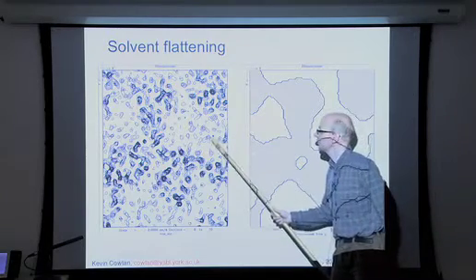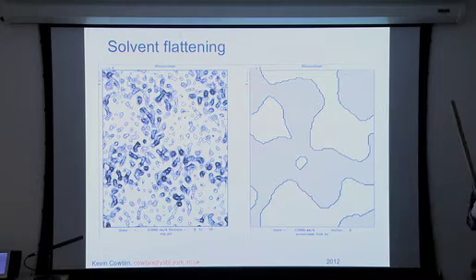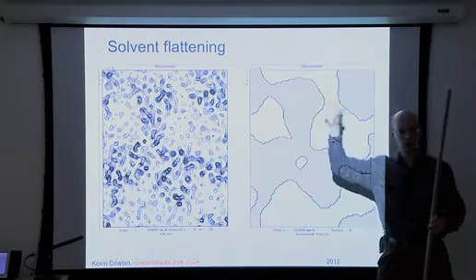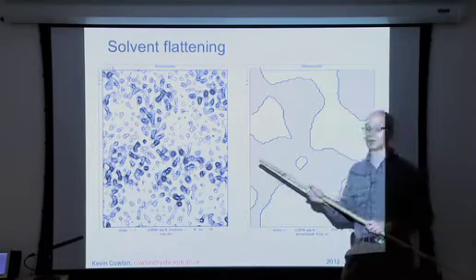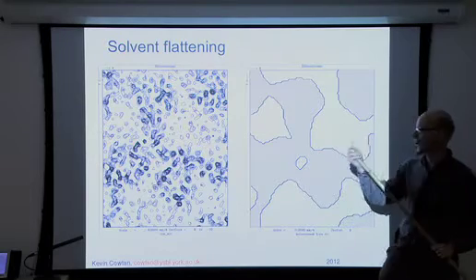So the question is, what are the features in the solvent? Well, if your phases are very good, then they correspond to ordered solvent, real features where the solvent isn't completely disordered. If your phases are very bad, then you also have a load of noise in there, and in practice the noise tends to swamp any real signal.